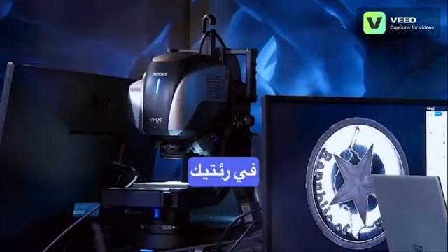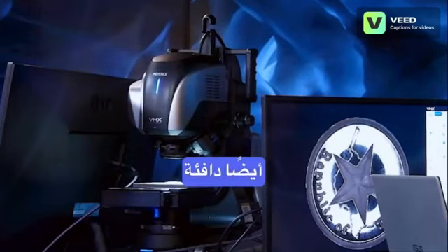You can see a more gentle flow as the water is shifting from one side of the slide to the other because of the heat of the microscope light. But remember, all of this is falling out of the sky. And if you inhale this, what happens in your lungs, which are also warm and wet?